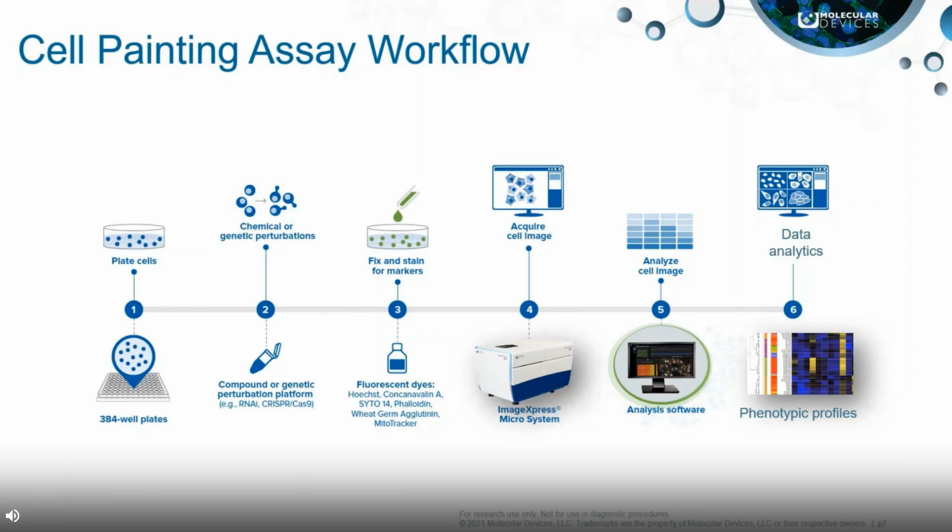Now, most biologists or cell biologists are very familiar with the markers that are used in the cell painting assay and also the protocol involved in the first half of the workflow. However, many are not trained to handle and analyze the large volumes of data that you generally get from these experiments. So typically, one would have to rely on collaborations with some in-house data science experts to carry out data analytics and then come up with some interpretation of the experiment.